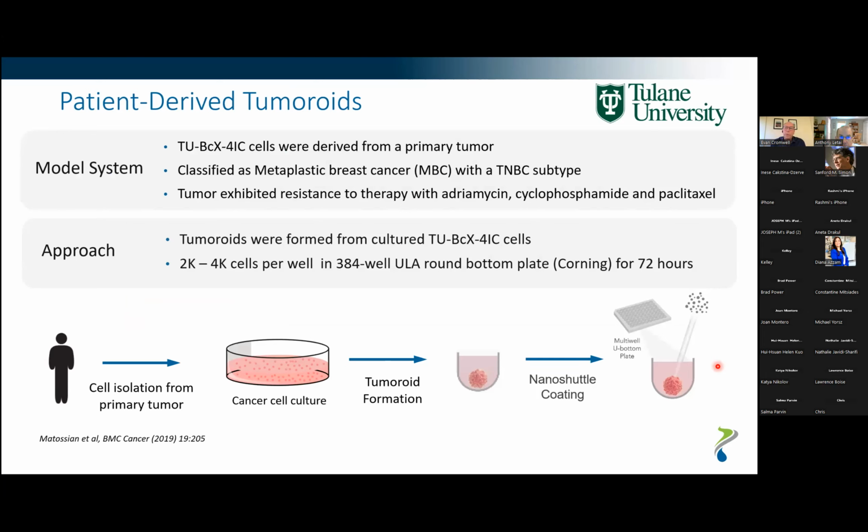Now, for this work, we worked with a group at Tulane University, Matt Burrow, and she's been doing work with triple-negative breast cancer patients from the New Orleans community, an underserved community, prominently a Black community. Her initial work had been with mouse models using explants, and she has a lot of published data there, but she wanted to move from using mouse explants to a higher throughput and better model, which was to create organoids in chips. And so we worked with her using different cell lines.